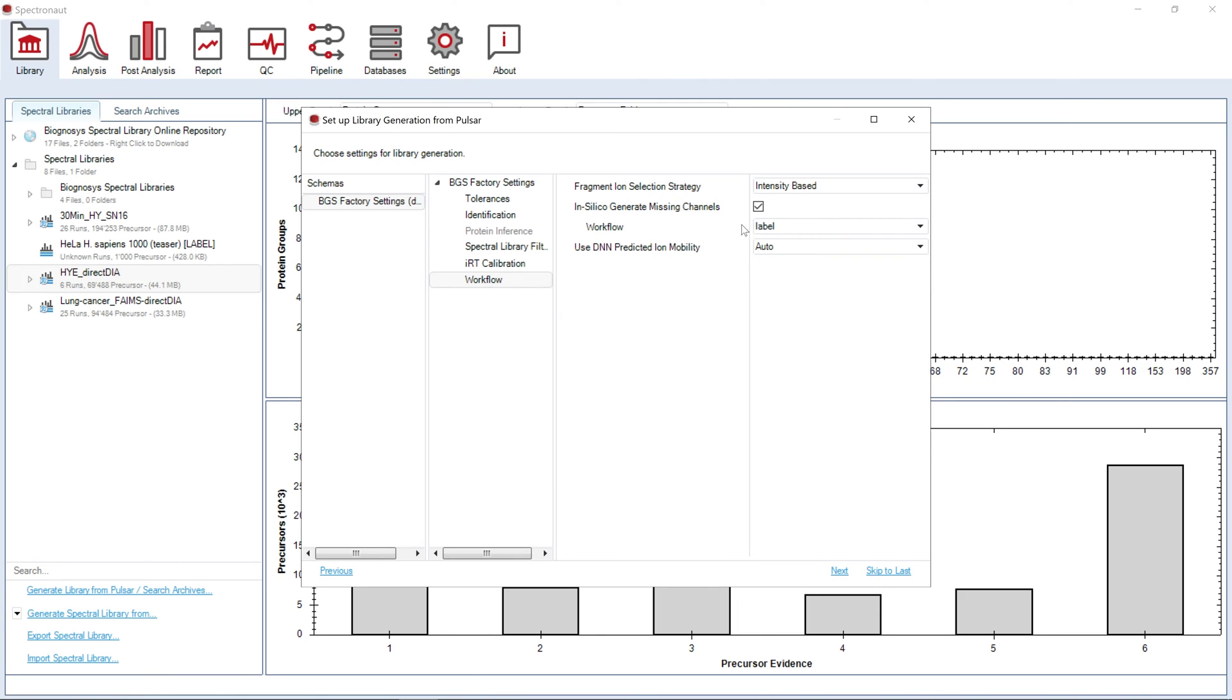If you hover over the setting with your mouse, you can find a box with a short explanation of each of the options. A detailed description of each of the settings can be found in the software manual.